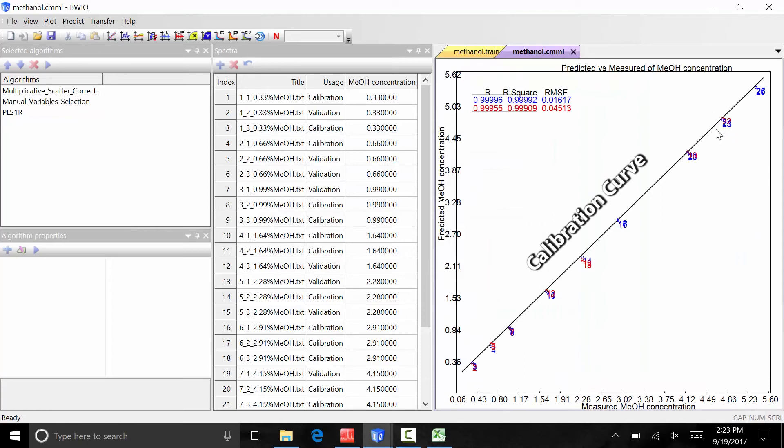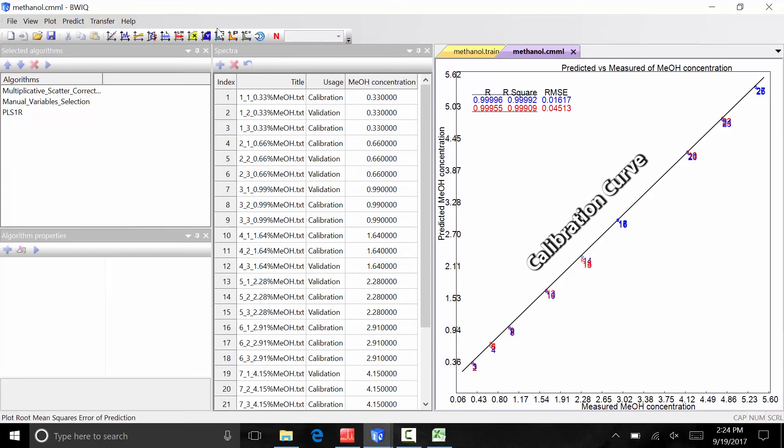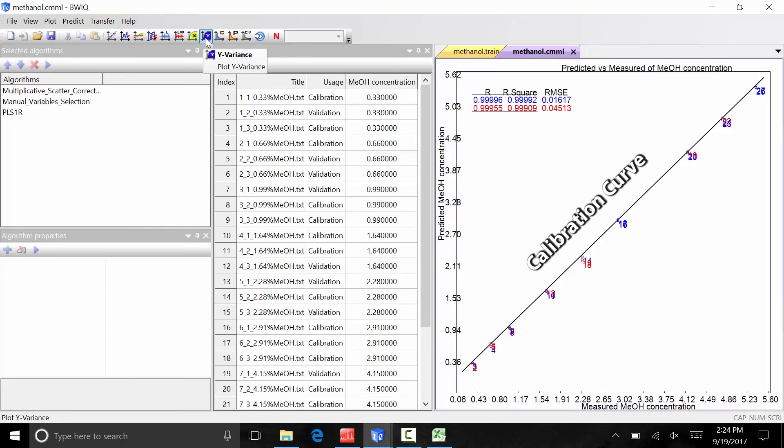The blue data on the curve corresponds to the calibration samples, while the red data are the validation samples. The r, r squared, and root mean square deviation coefficients for the calibration and validation sets are also calculated, indicating the linearity of the calibration model. There are several other plots available to view the calibration and validation data, including loadings, variants, and residuals.